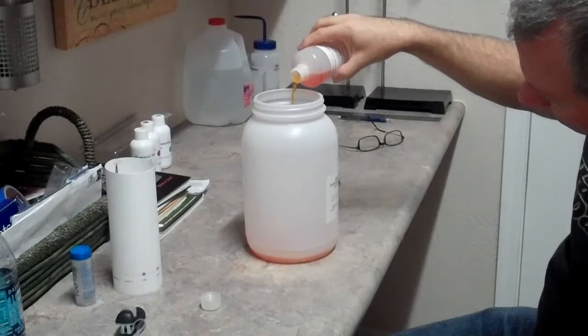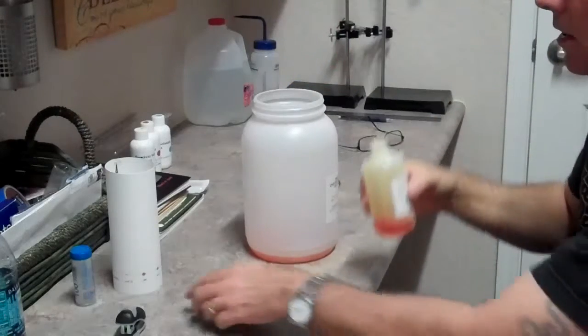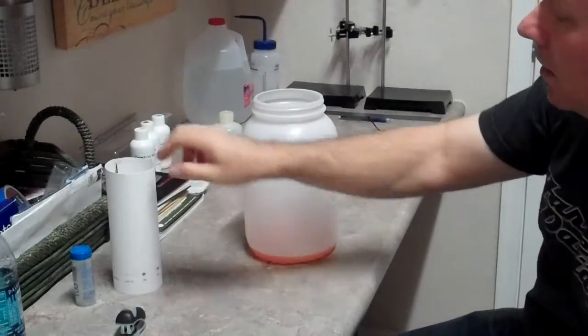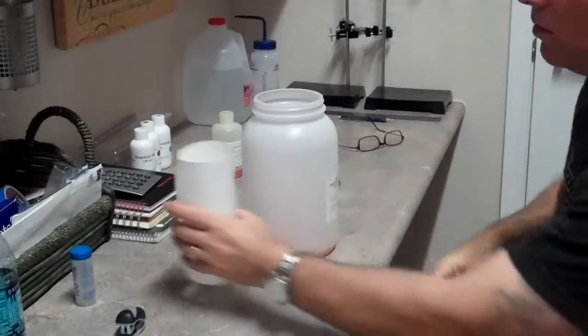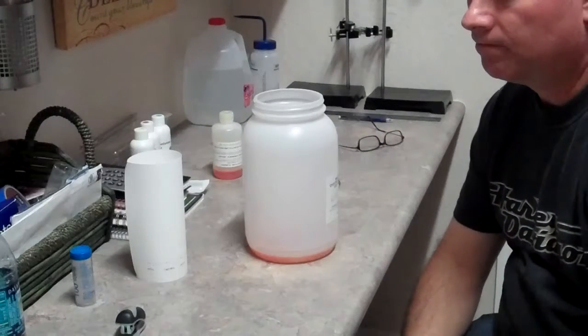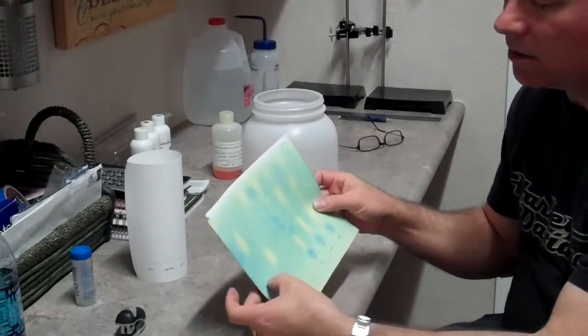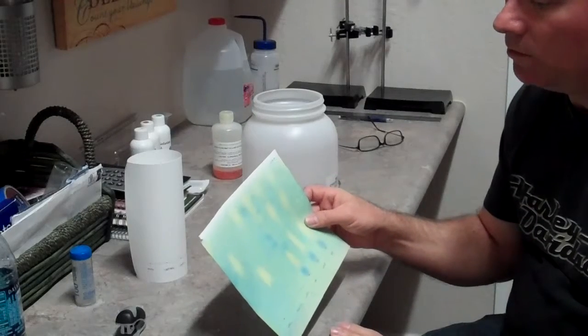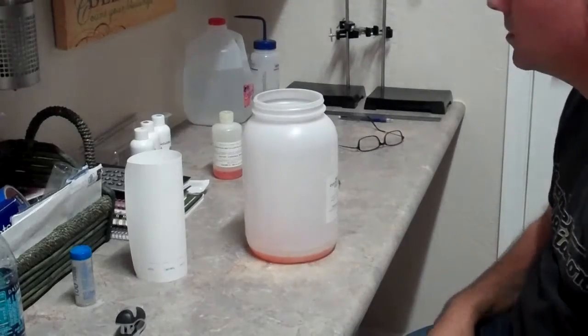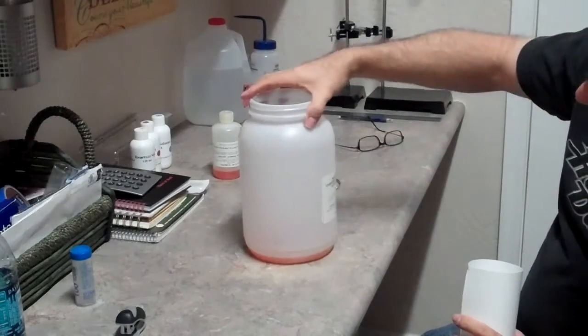This solvent is reusable, so whatever doesn't soak into your paper can be poured back into the container and reused. The solvent shelf life seems to be fairly long. You can always tell when the solvent is going bad because when your paper develops, instead of having this blue-green background, it will be basically an orange background.